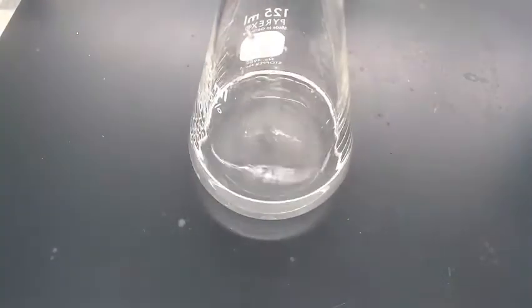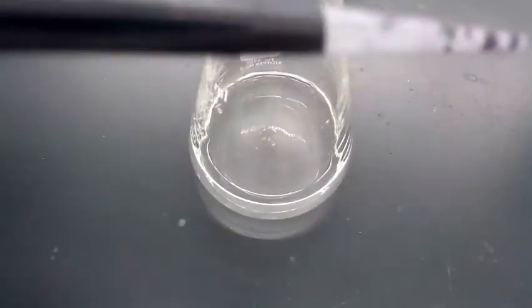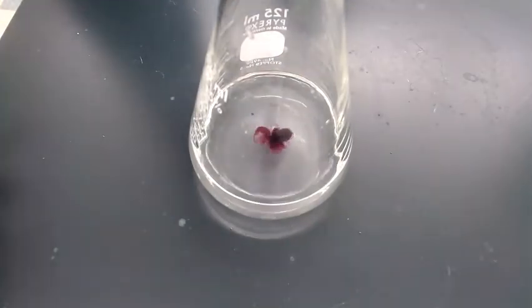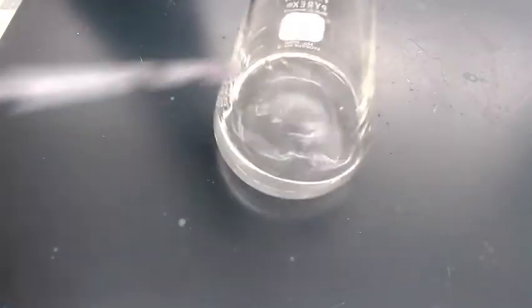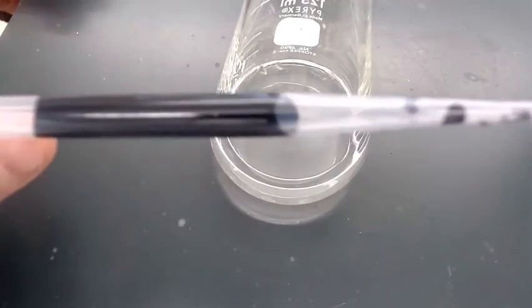Oh, all gone. This is very much like the titration we were doing when we had the phenolphthalein as an indicator, but we don't need an indicator solution because when we make a solution of potassium permanganate, it's this really cool purple. So I know that this permanganate ion is floating around in solution, and right now it's in my pipette.